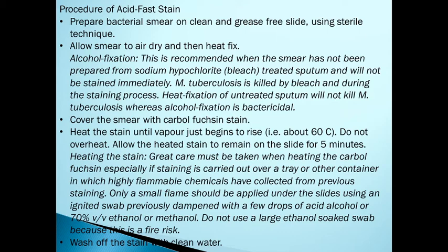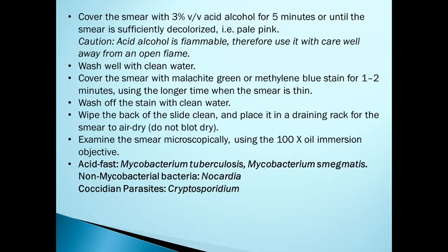Then wash off the stain with clean water. Then cover the smear with 3% volume by volume acid alcohol for 5 minutes, till the smear is sufficiently decolorized, that is, pale in color. Then wash it with clean water.